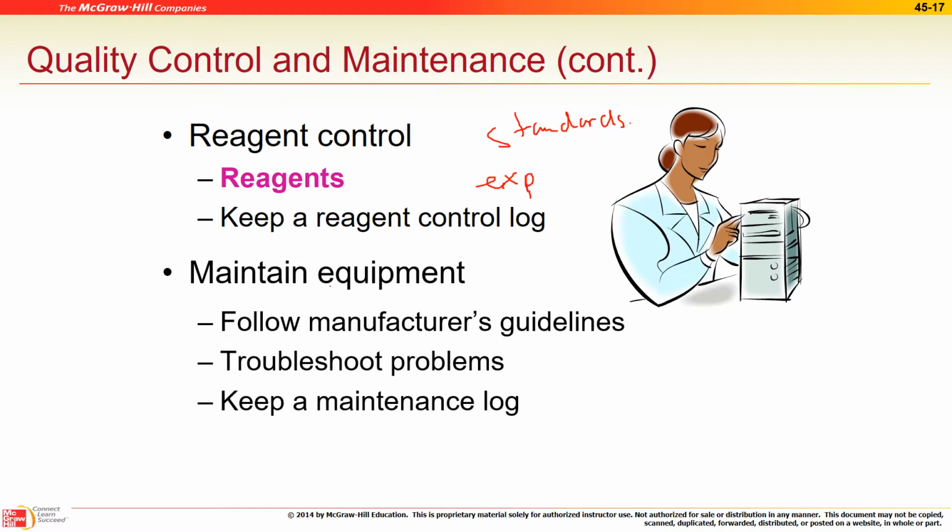Maintain equipment. At minimum, your equipment is probably going to need to be calibrated at least once a year. You can get them to come into your facility, or you must send your equipment out. Either way, make sure you have a backup while it's going through calibration.